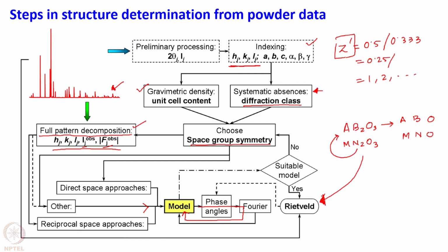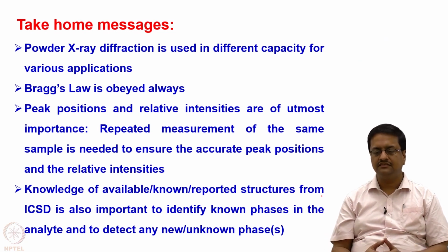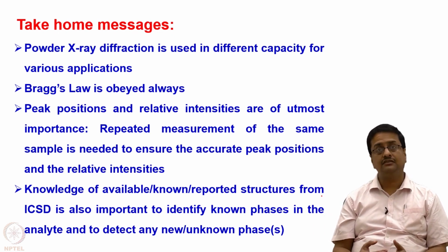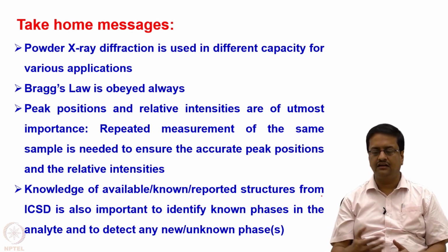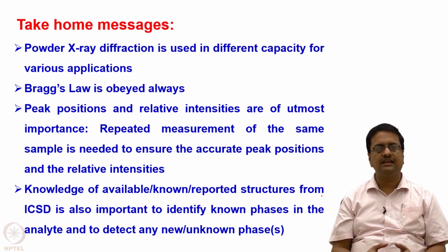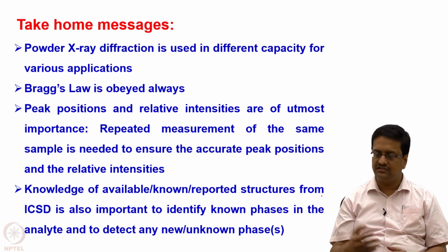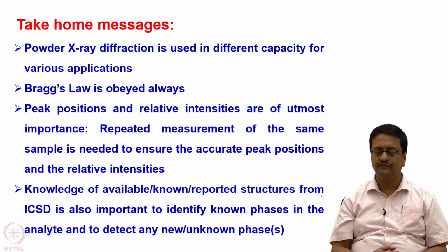I must say that this structure solution from powder X-ray diffraction is still very difficult even today. So the take home message is powder X-ray diffraction is used in different capacity for various applications. Bragg's law is always obeyed. Peak positions and relative intensities are of utmost importance. Repeated measurement of the same sample is needed to ensure the accurate peak positions and relative intensities.